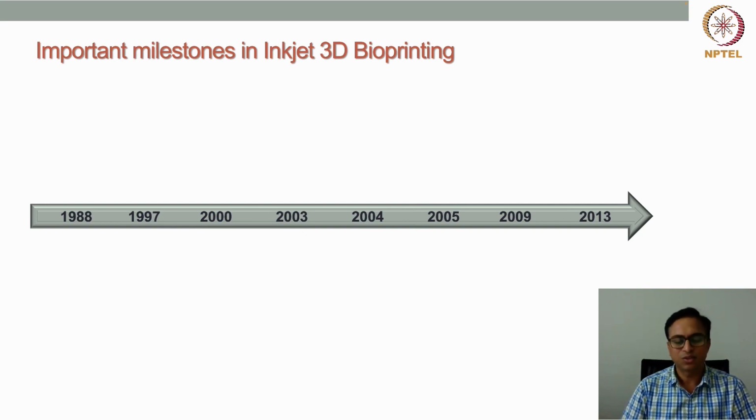But then a few scientists found that this printing technology can be used for printing biomaterials, biomacromolecules, even biomolecules, and even cells.